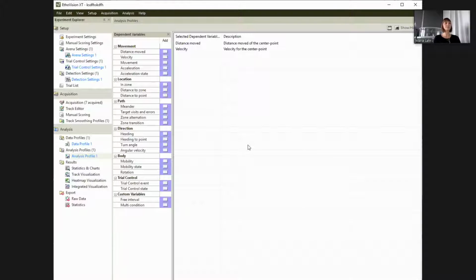Of course, it would be interesting to know, these are the 2 parameters it always gives us. The distance moved could be very interesting, because when we know it was swimming in there maybe for a longer time and it moved a huge distance, then this mouse was not very good in the task. We also always get the velocity. This could maybe be interesting, but we definitely want to know the latency. So we want to know how long the mouse was in the pool.